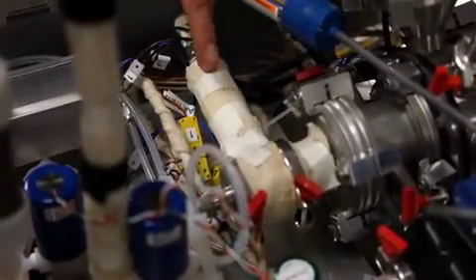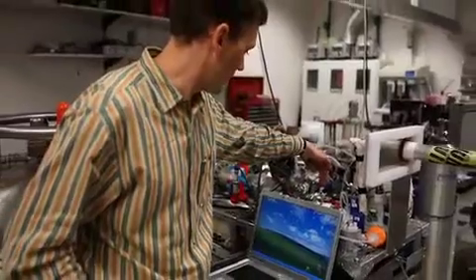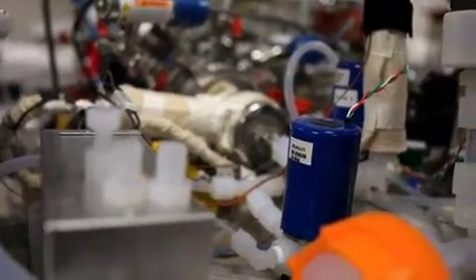In this study, we developed a new mass spectrometer to measure gas phase acids in air. The way this works is we generate in our instrument acetate ions, and these ions will react very specifically with gas phase acids. And then the ionized molecules we can detect with a mass spectrometer. What this measurement does for us is provide fast response measurements. Within seconds we can see a change in levels of these compounds.